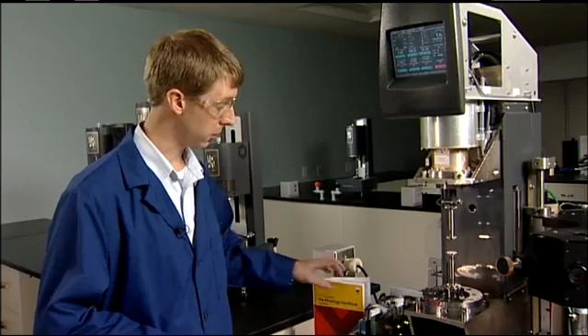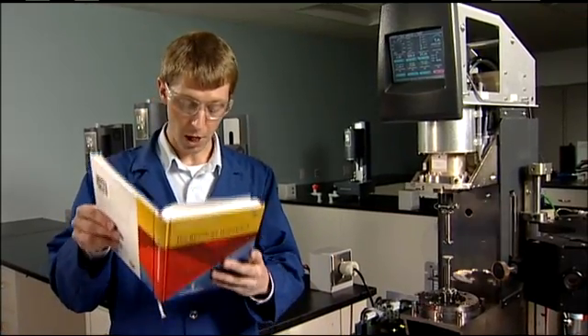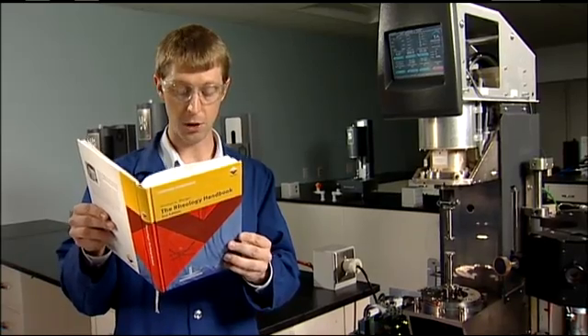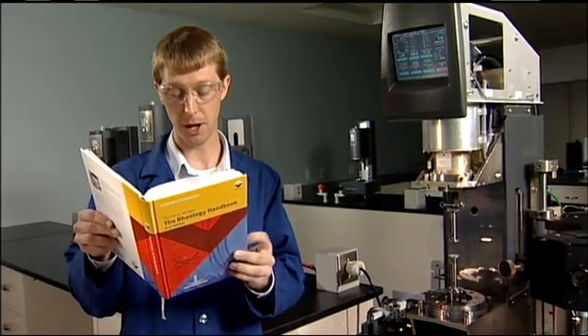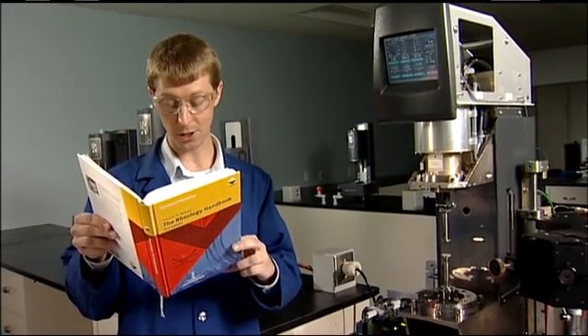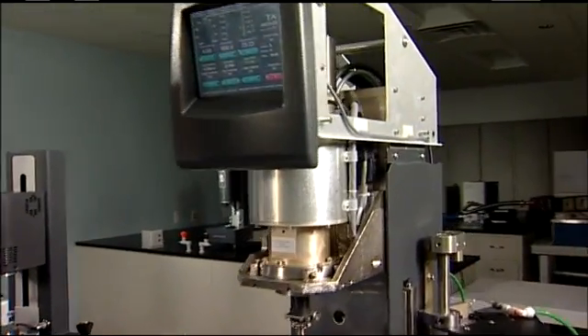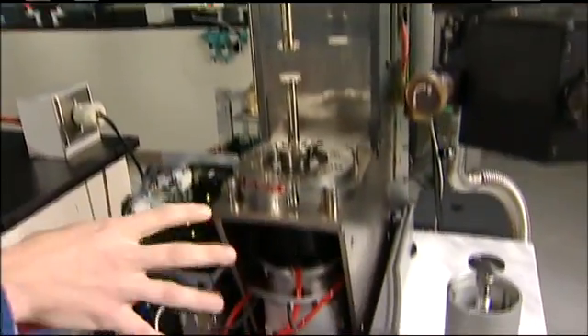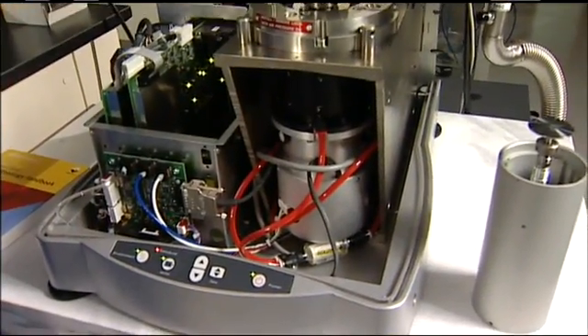They clearly state in this handbook: rheometer designers aim to keep the amount of the instrument's internal friction and inertia effects of the rheometer as low as possible. They continue on to say: since there is friction and inertia, these disturbances have to be corrected by the electronic controller. The superior design of the Aries G2 with its separate transducer and motor eliminates the need for motor friction and inertia corrections.